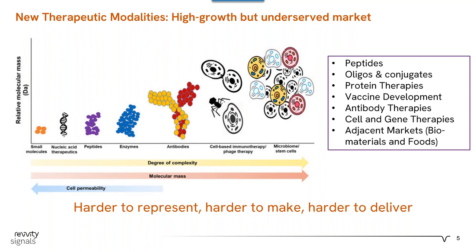And furthermore, working with a variety of these modalities, creating an ADC, for example, requires software that captures the necessary metadata. It just increases the sophistication.